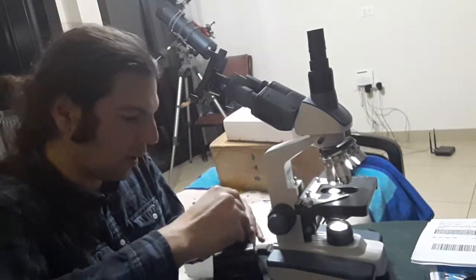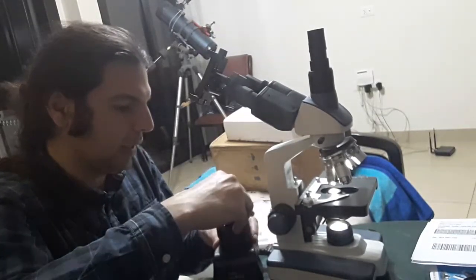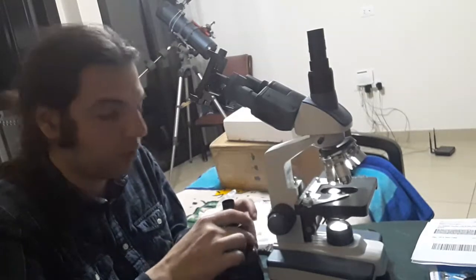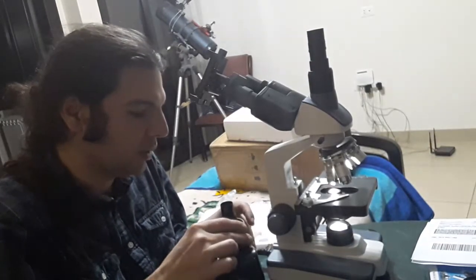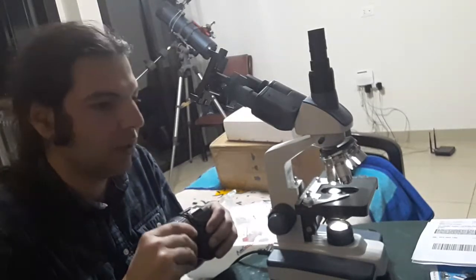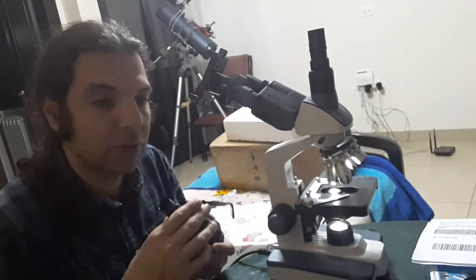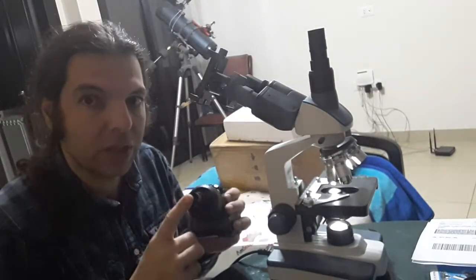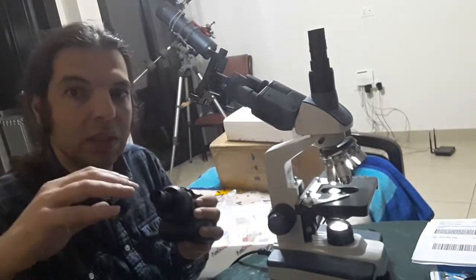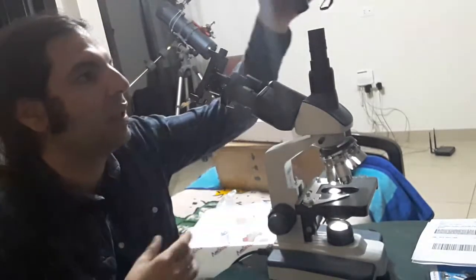It's a little tricky to install. This camera has Wi-Fi by the way, so you can connect to it using a mobile phone. If you want to stream it to the internet, it's better to use the USB connection. For Wi-Fi streaming, you can use an app called Stream Screen over HTTP, which works on both Android and iPhone, and it will record and broadcast what's on the screen.